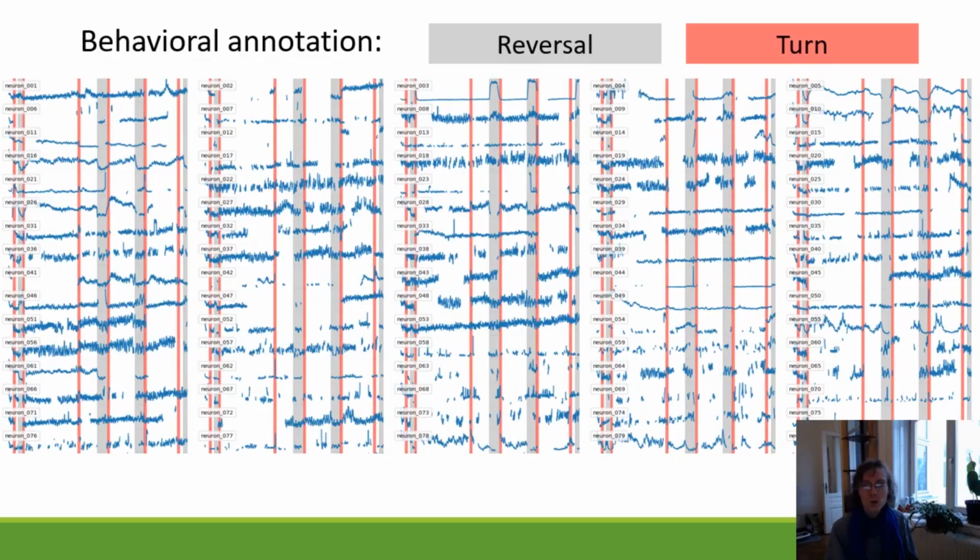Okay, wonderful. So a fully automated output of this pipeline, a subset of the neurons that I'm going to show you, is as follows. We can see some activity that is associated with certain behaviors and across multiple neurons. For example, this increase in the white forwards and decrease in the gray reversals, and vice versa, increase in reversals and decrease in white forwards, and some more complex behavior as well.